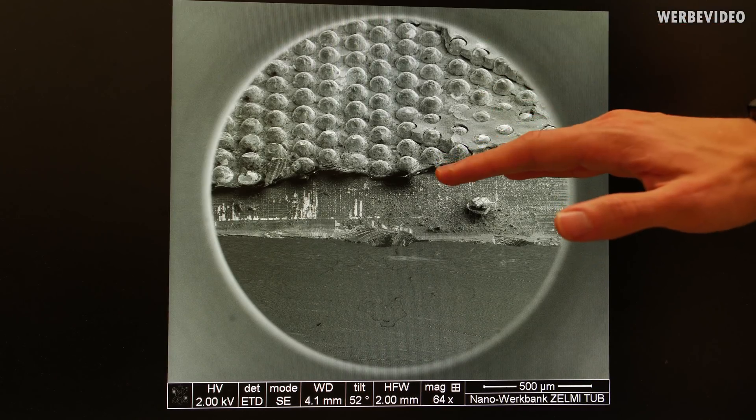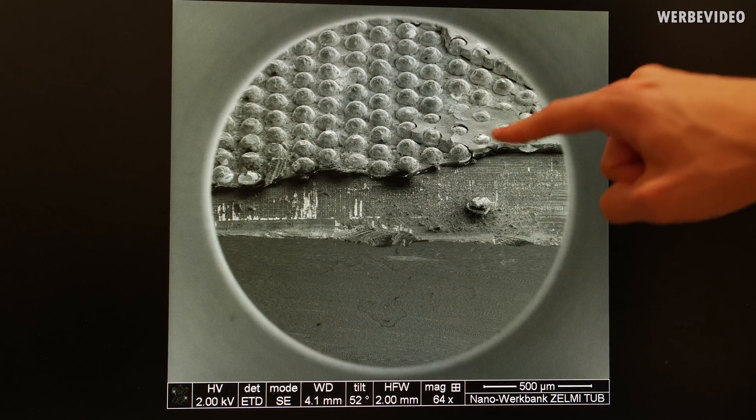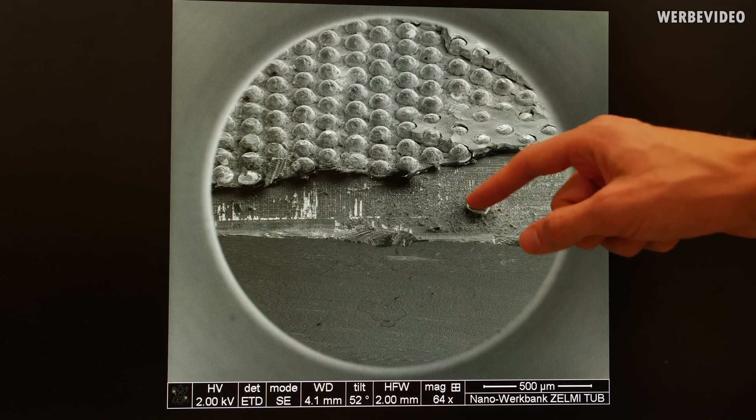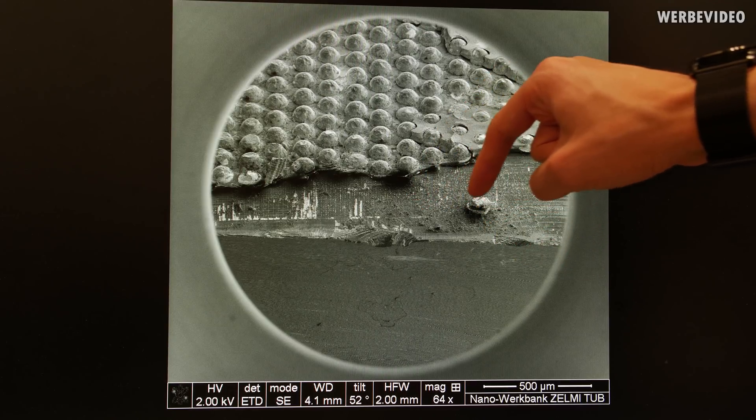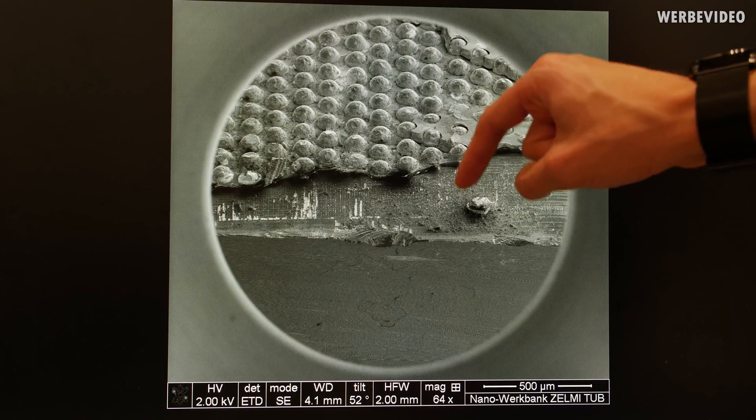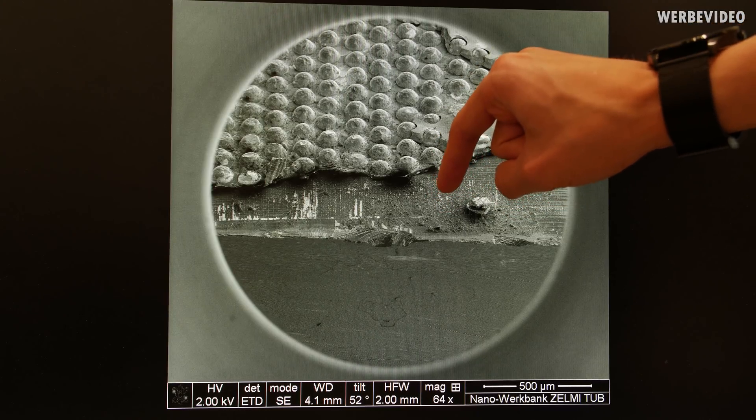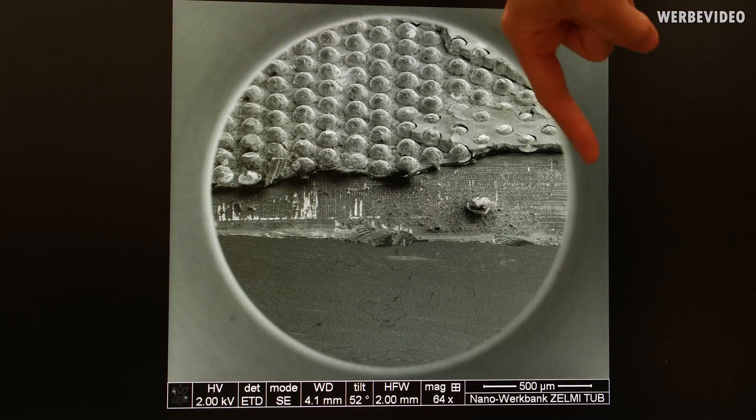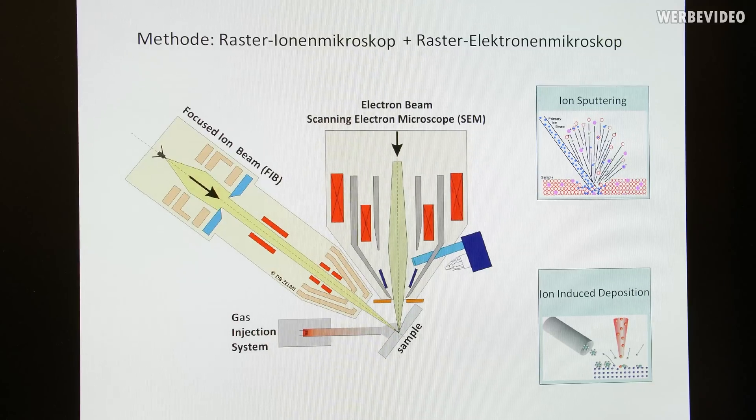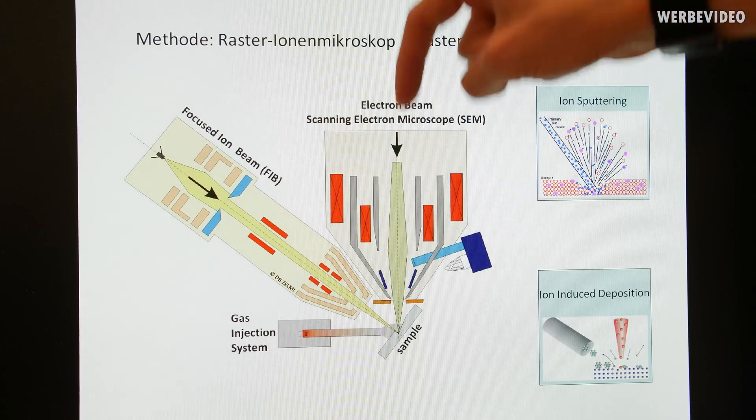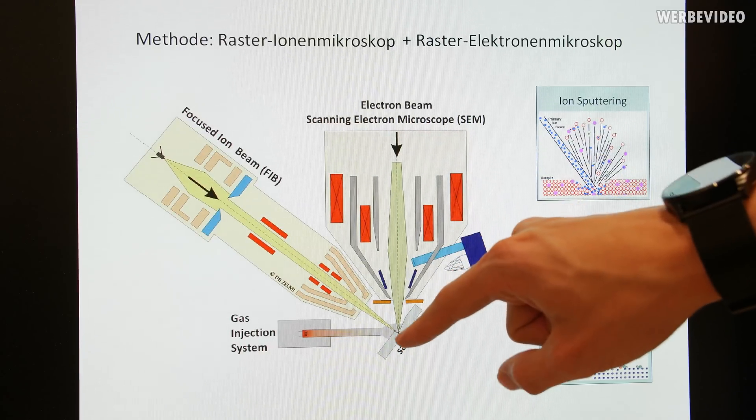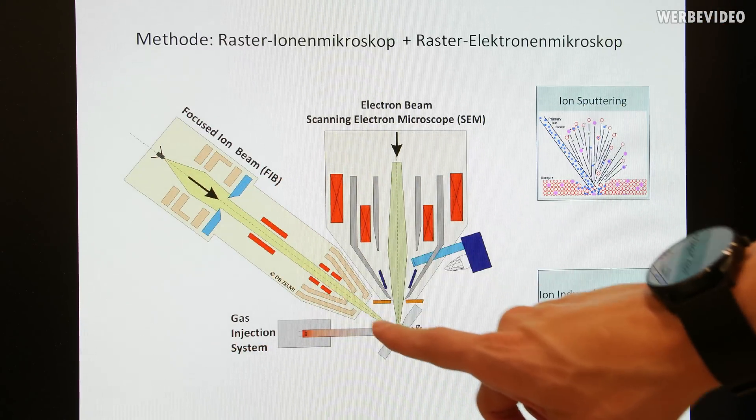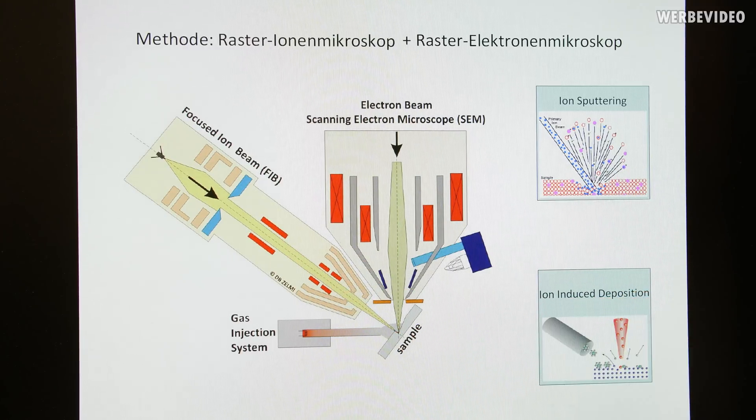This image shows the top side of the 9900K again. We can see the solder bumps which we just saw under the normal microscope. Underneath we can see a little bit of the structure but the real structure inside the chip is still not visible. To make this structure visible we will have to cut a small fin, a small lamella, with a focused ion beam out of this material. This picture is taken with an SEM, a scanning electron microscope, which is basically using an electron beam across the material to show this image. The particular SEM we're using here has not only an electron beam which comes from the top, it also has a focused ion beam going from the left side and that's the one we need to cut out the small fin or lamella out of the silicon.